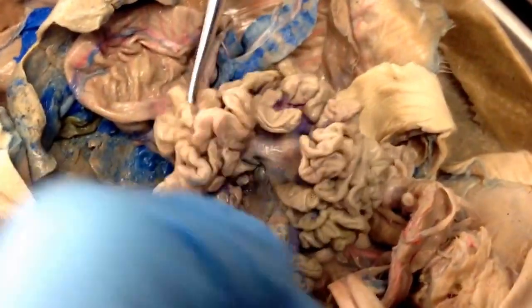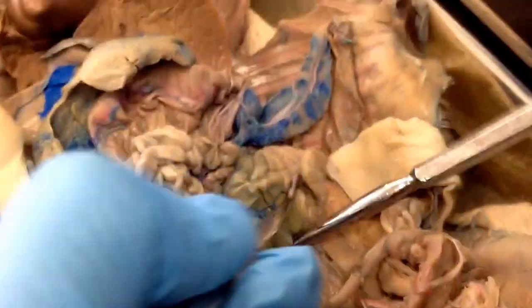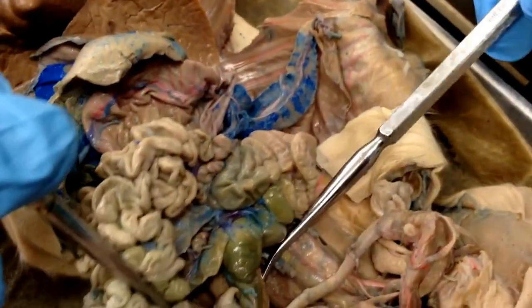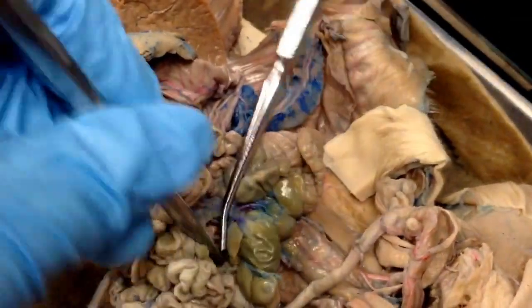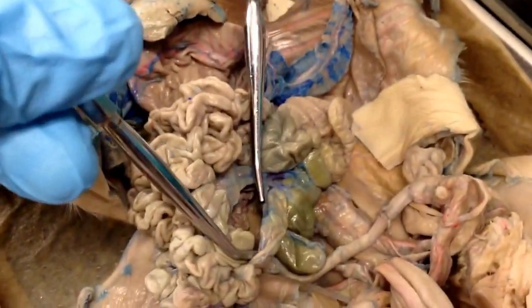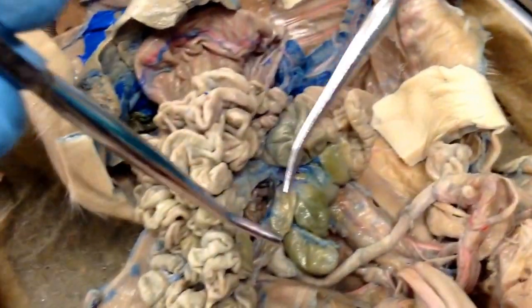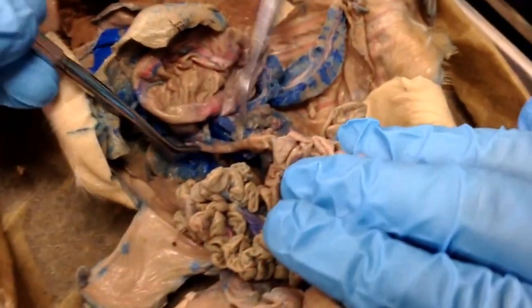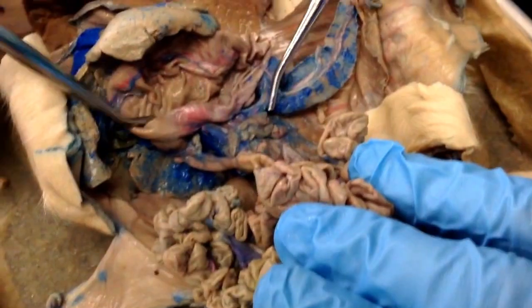So then this is the small intestine. Right there where it looks like it's still intestine. There. That's the colon. That green thing is the cecum. And that is the ileocecal sphincter, which leads into the ileum part of the small intestine. And between the duodenum and the ileum is the jejunum. And that's the pancreas, which contains cells called islets of Langerhans.